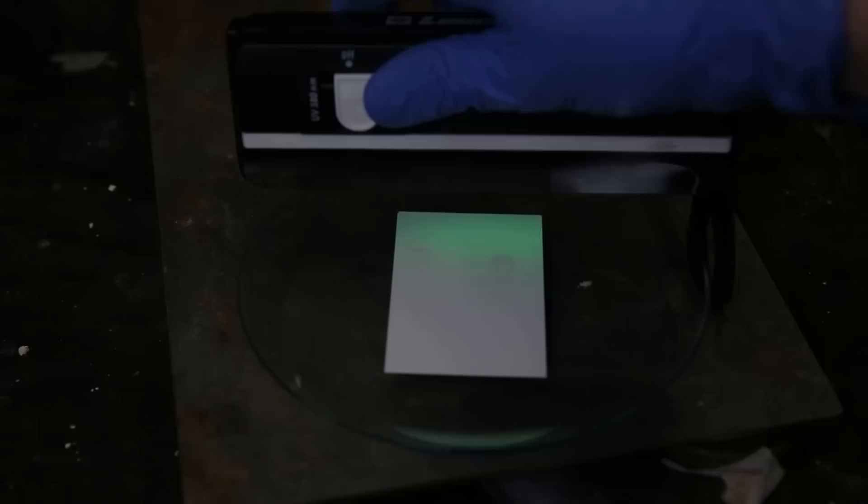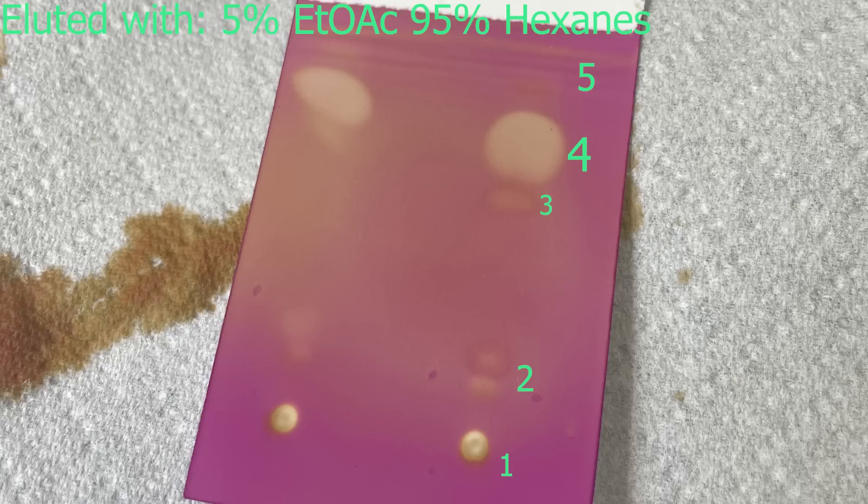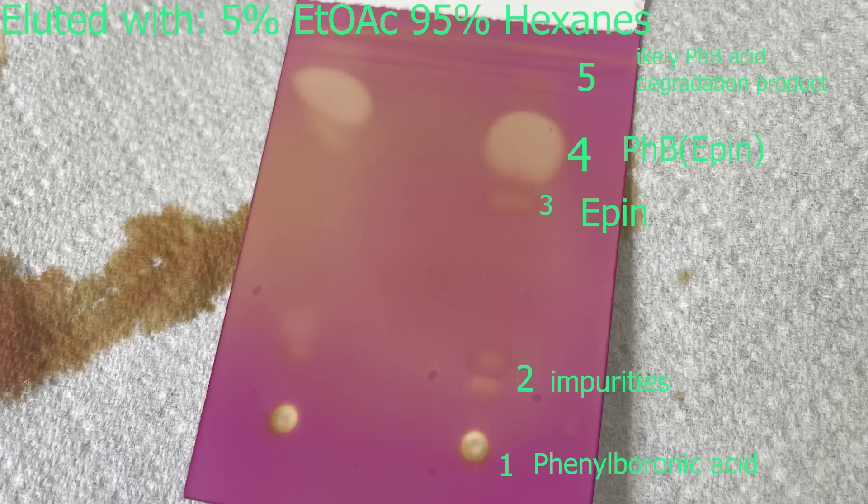I then stain the plate with a potassium permanganate solution and heat the plate with a heat gun to develop the spots. On the plate, we can see at least 5 or 6 compounds are present. On the bottom, we have phenylboronic acid, which doesn't move on the TLC plate. Then above that, we can see 2 small spots that are likely some impurities. Since phenylboronic acid is not stable on silica gel, it degrades and likely creates multiple different spots. The next spot we are seeing is epin, which is very faint. The spot after that should be the phenyl B-epin, which is also the largest compound present.